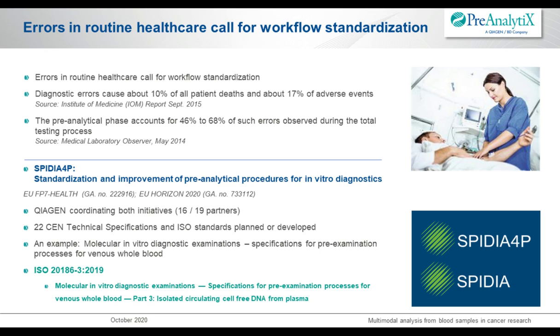This ended up in an ISO norm, which was published last year for ccfDNA isolation, and this is shown at the bottom of the slide. Within this ISO norm, there is clear guidance on how to work with ccfDNA and how this needs to be standardized.